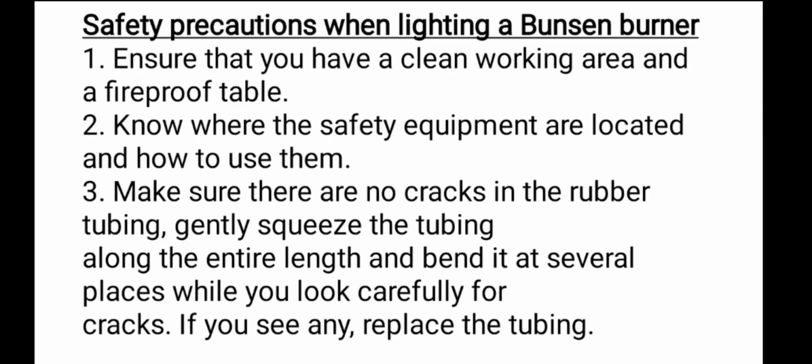Then, as we approach the end of today's lesson, we look at the safety precautions when lighting a Bunsen burner. These are things you have to be really careful about when lighting a Bunsen burner. One, you have to ensure that you have a clean working area and a fireproof table.